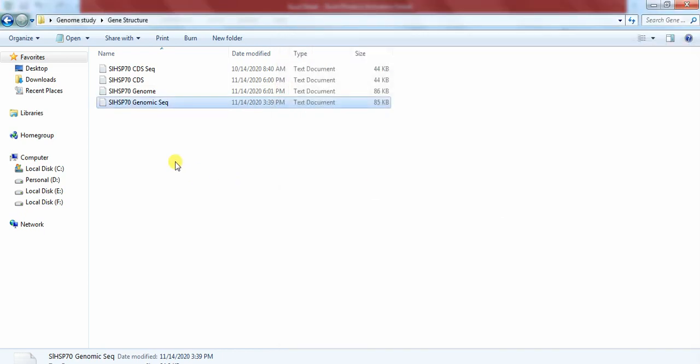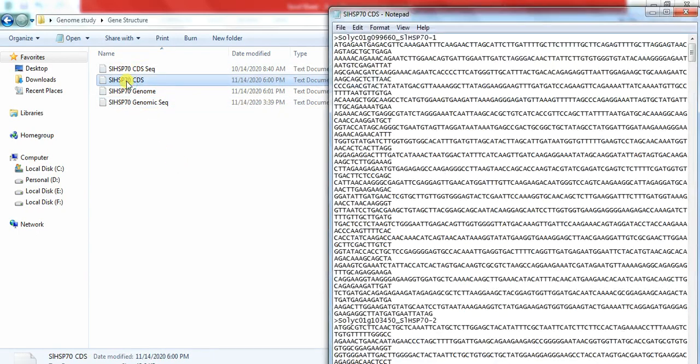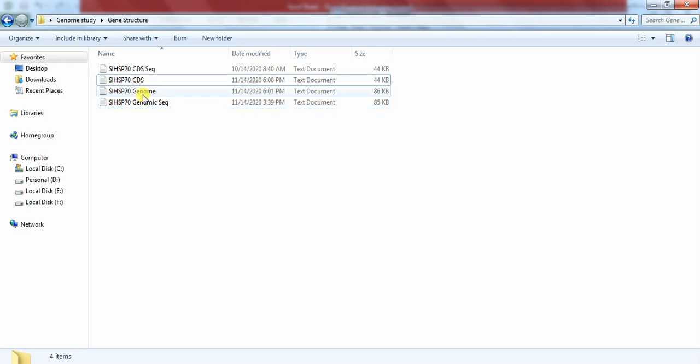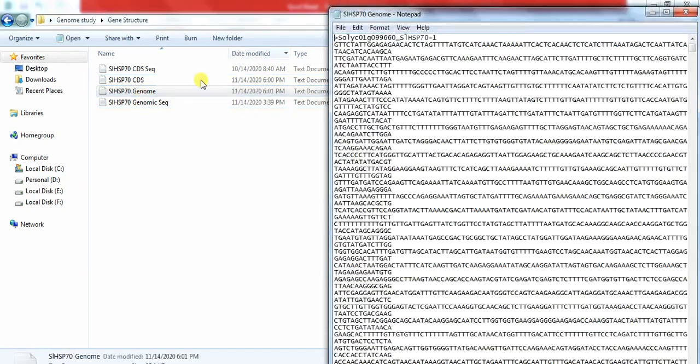Now we check that file. So in this file the name is changed into transcript as well as gene name. And now in genome file it is also containing the transcript as well as the gene name.